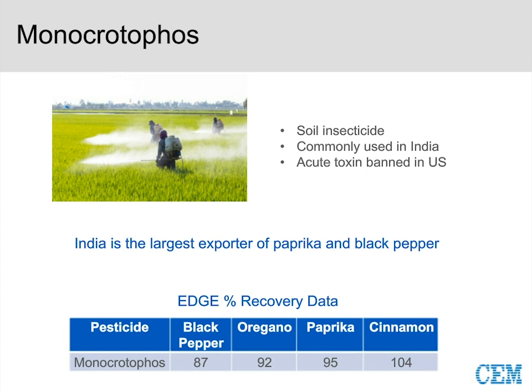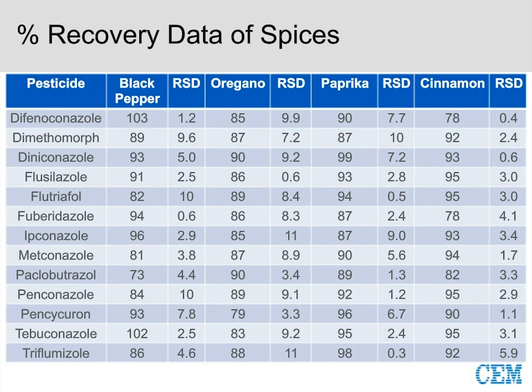So what I've done is pulled out a list of fungicides here. Again, I didn't want to overwhelm you with a graph of everything we looked at and not even be able to read the numbers or anything. I want you to see this data. I want you to see what we're getting and what we're doing. So I just picked this group of fungicides to zone in on and look at.